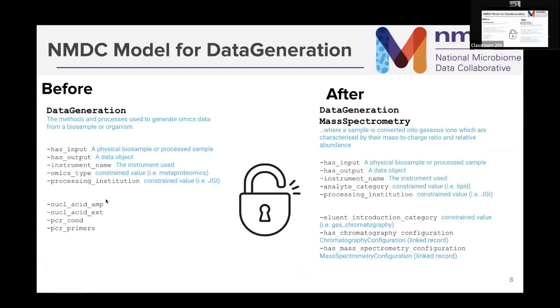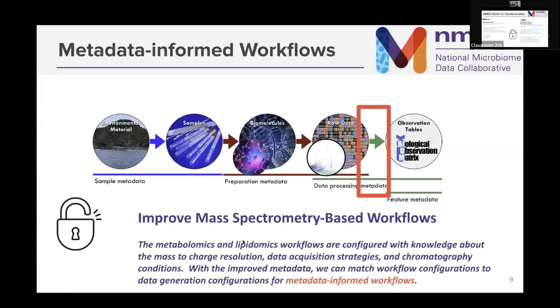These fields are no longer the PCR nucleotide sequencing. Those are on that subclass, but not on the mass spectrometry subclass. And this was a big unblocker for other aspects of NMDC. I really just want to highlight how this restructuring of the metadata, the restructuring of the schema in order to hold more applicable metadata, really unlocked some things.